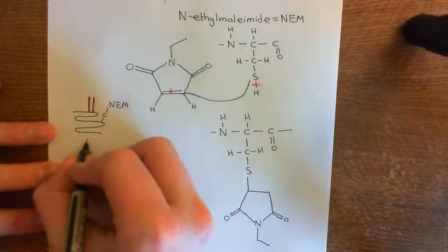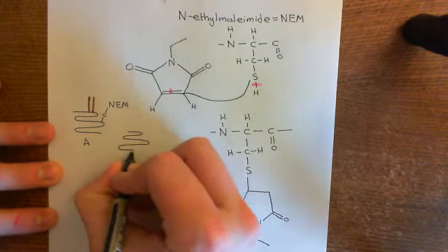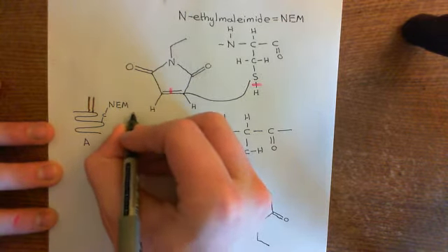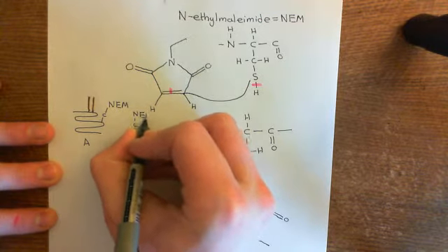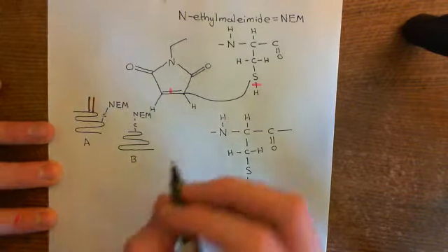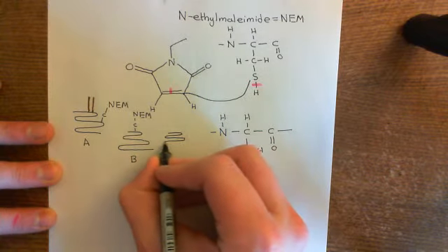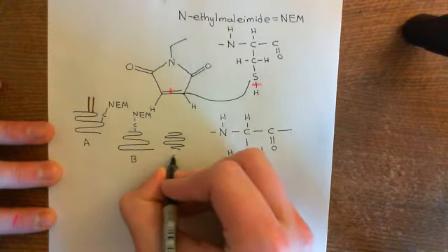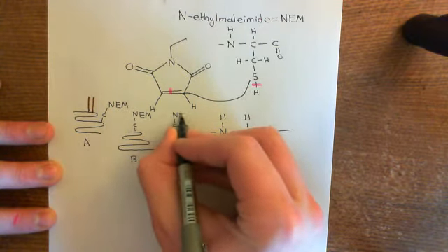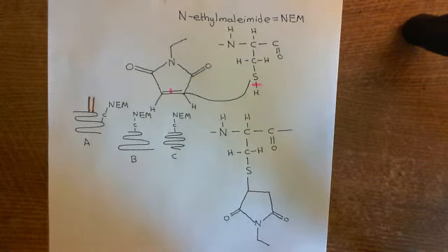And this won't just happen on protein A, it will also happen on protein B. So if we've got protein B over here, and B has a free cysteine residue, then again, that free cysteine residue will get an N-ethylmaleimide molecule bound to its thiol group. And again for protein C, all of the free cysteine residues in protein C will also get N-ethylmaleimide molecules bound to their thiol groups. So that basically neutralizes the free cysteine residues.